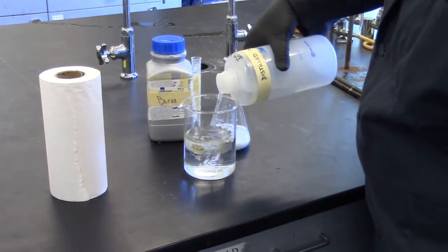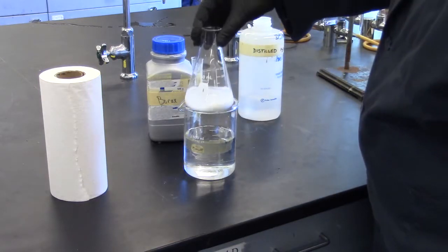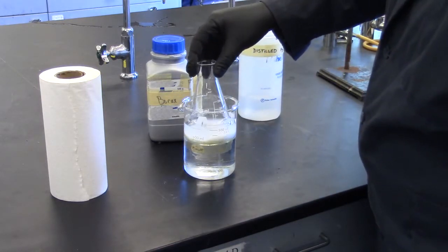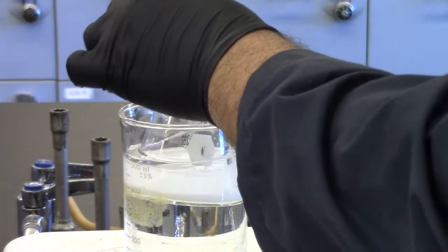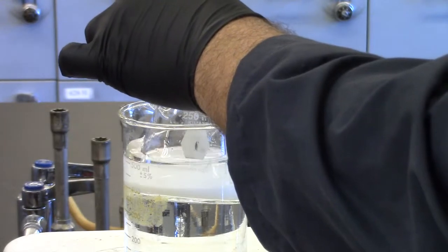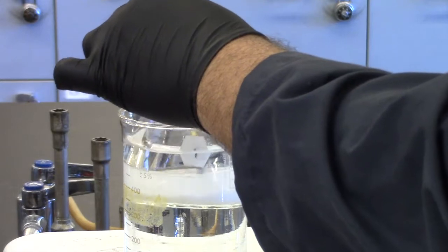Place this flask into a 600 milliliter beaker of water. The beaker will serve as a heating bath. Heat the bath very gently until the bath temperature and solution are at approximately 55 degrees Celsius.